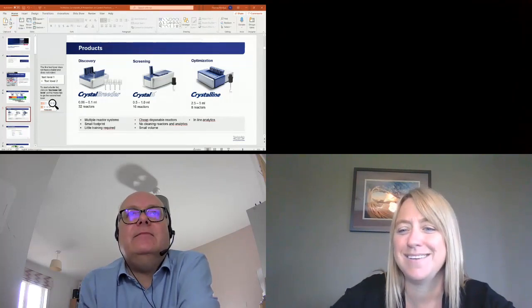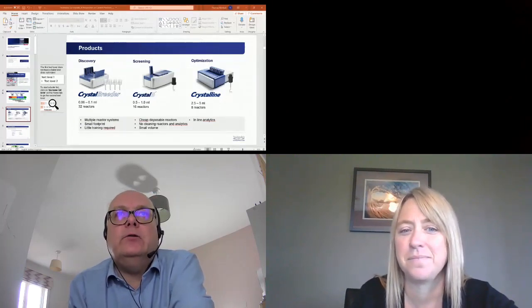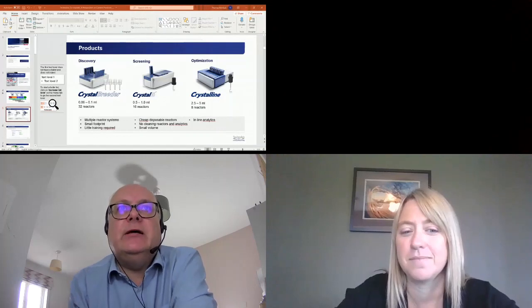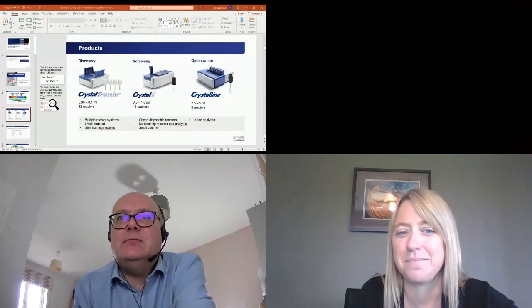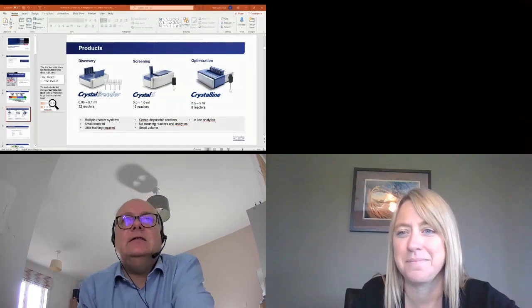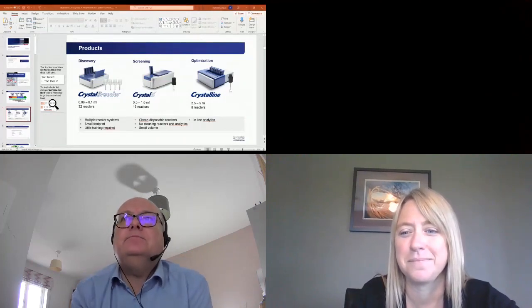Okay, I think the co-crystal area is quite an interesting area. I've worked on one co-crystal in my past, and we did have some problems trying to scale it up. That was really the origin of my question, which is just controlling the stoichiometry. We had to use some kind of melt extruder, I think, in the end to try and figure it out. But yeah, this looks like a nice platform for at least screening for co-formers.